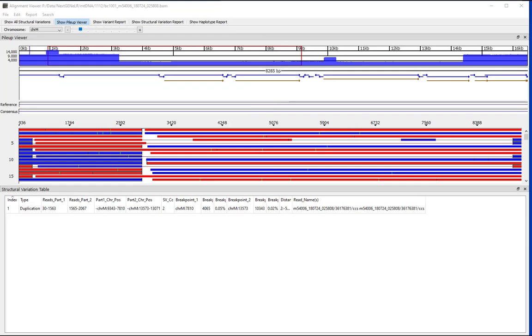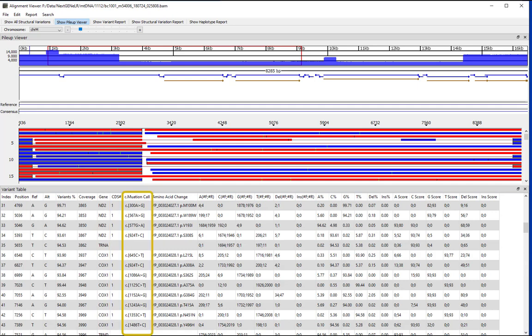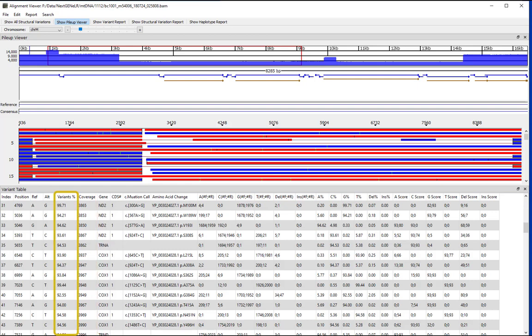To view the variant report for smaller indels and substitutions, click Show Variant Report at the top of the viewer. This report provides annotation and statistical information for each detected variant, including the chromosome position, gene name, exon number, c-dot mutation call, amino acid change, the total coverage at the variant position, variant frequency, and read counts and frequencies for each nucleotide and insertions and deletions at the position.